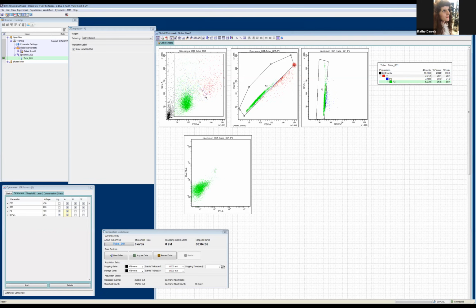And then as a second response there, the area scaling factor is going to be very important for singlets. Because these are lymphocytes, the area scaling is pretty nice and on point, but it's not always going to be that way, and we'll address that in future sessions. Okay, so one final question.